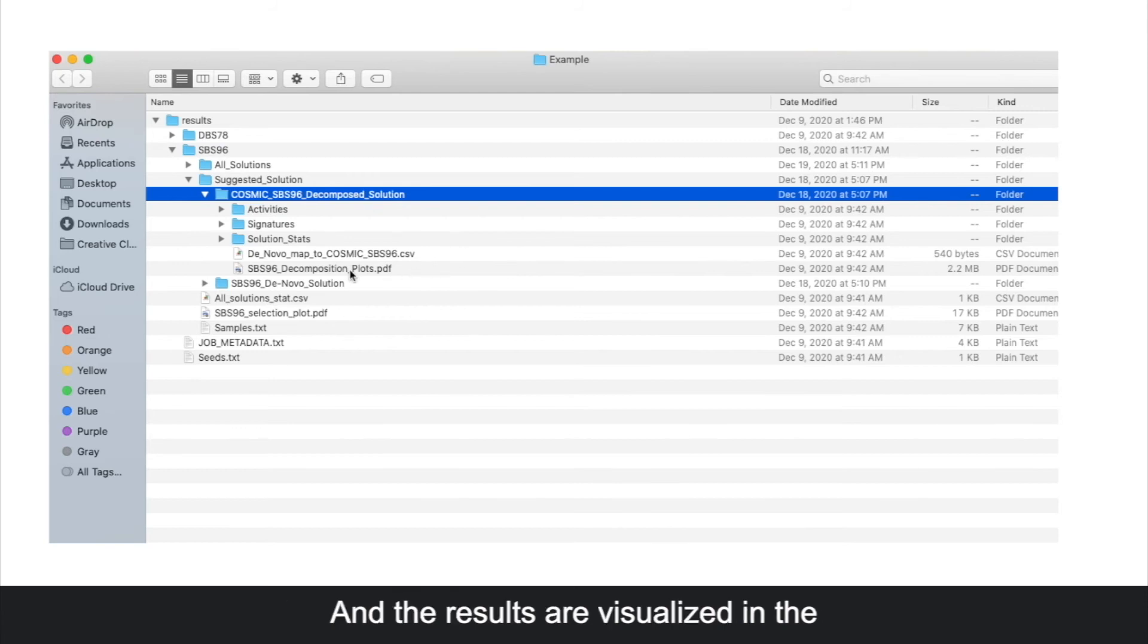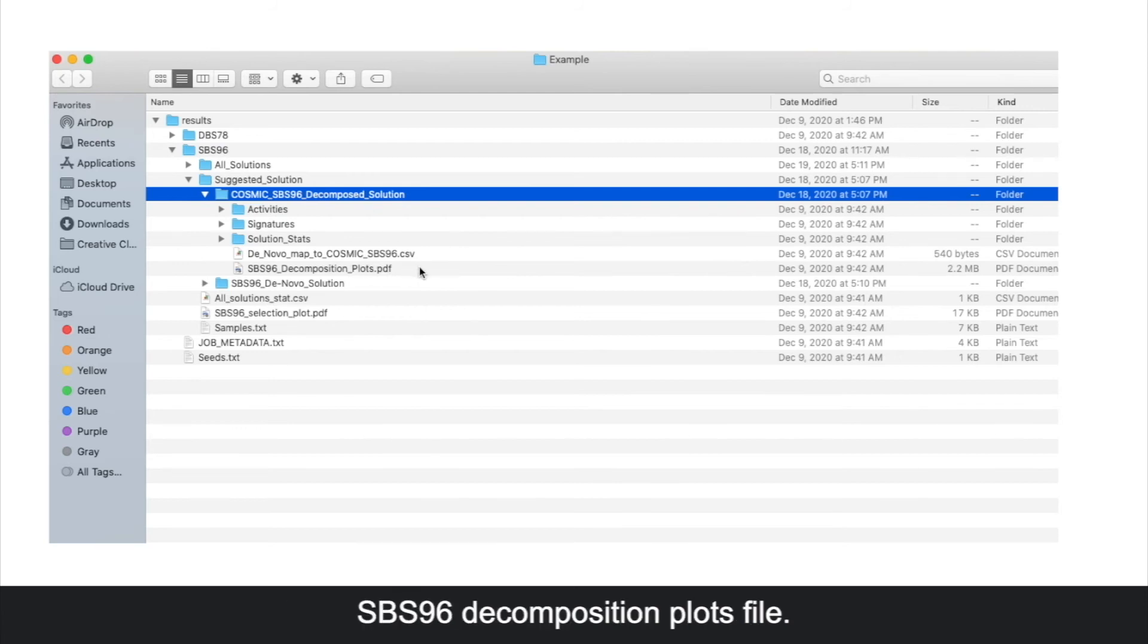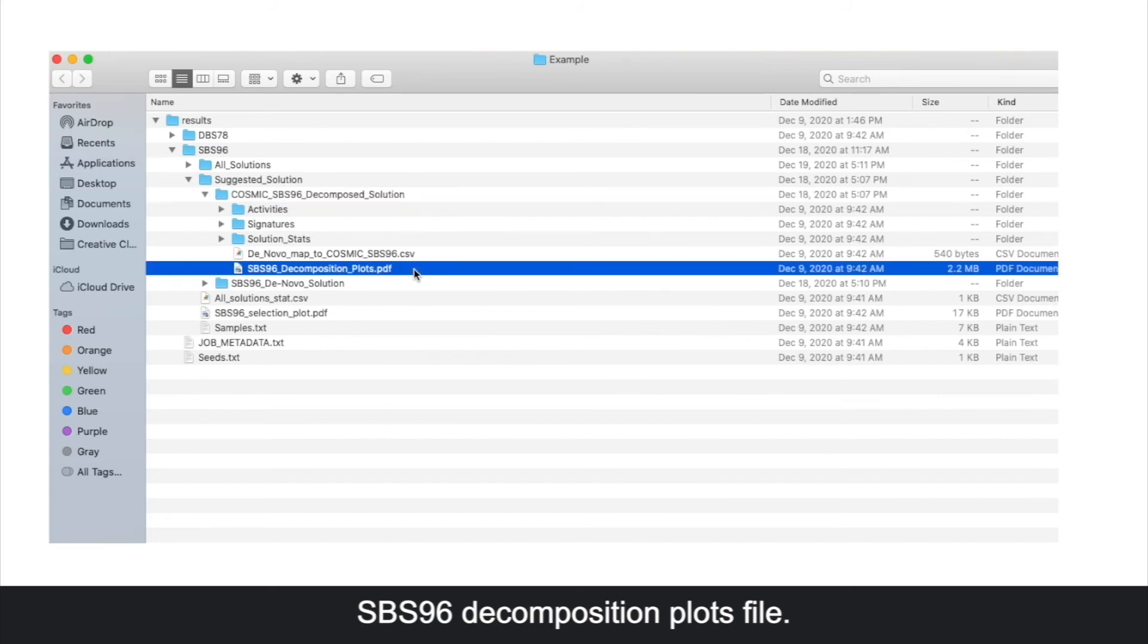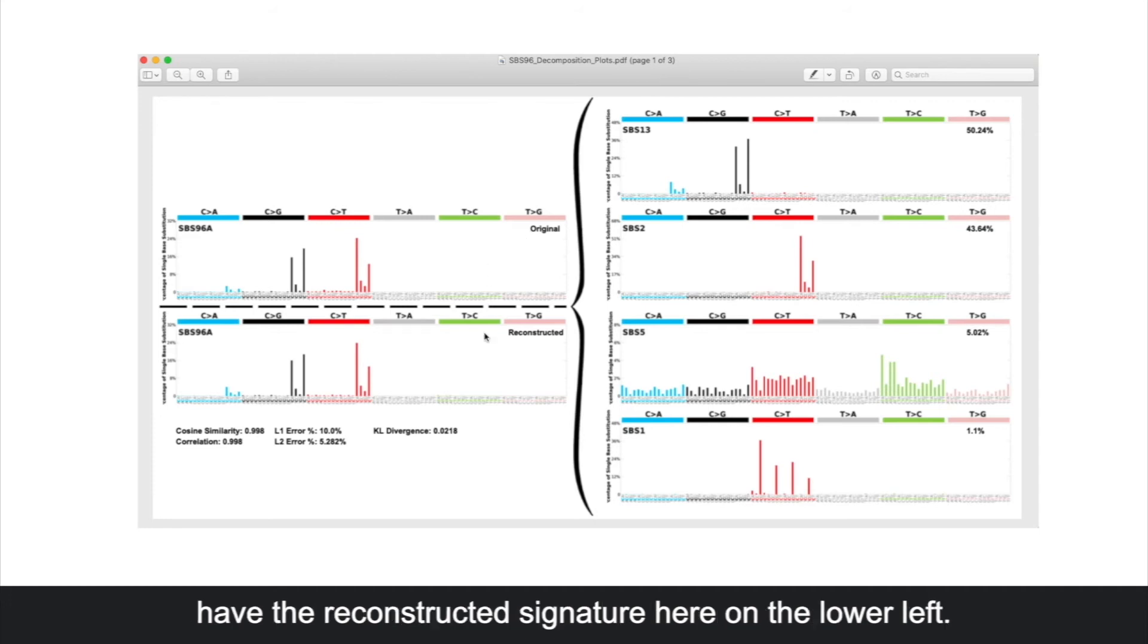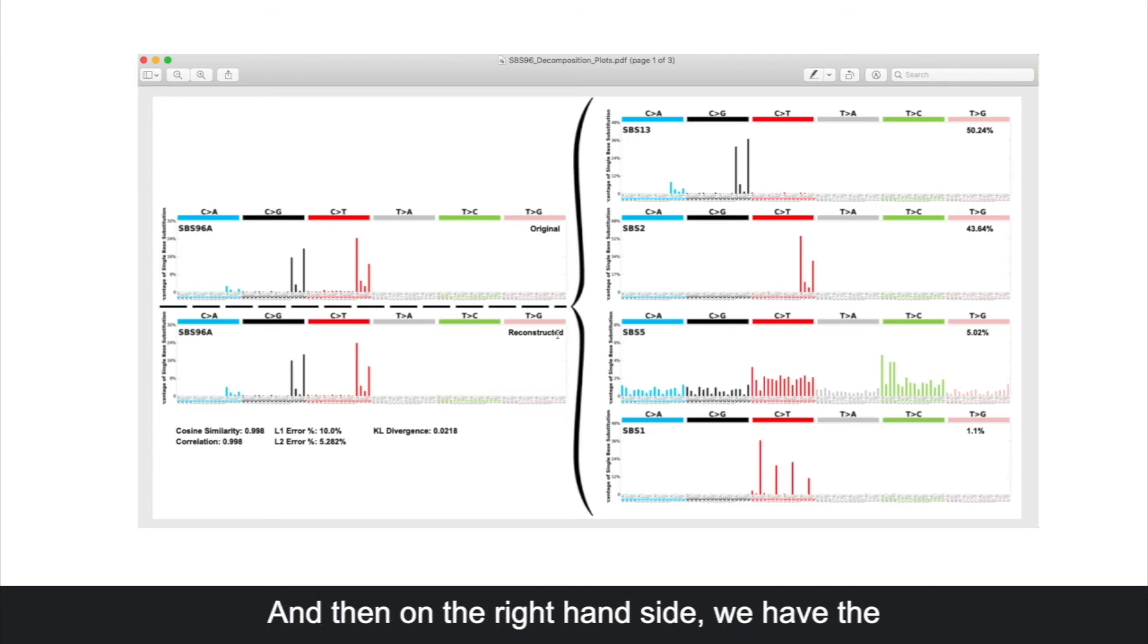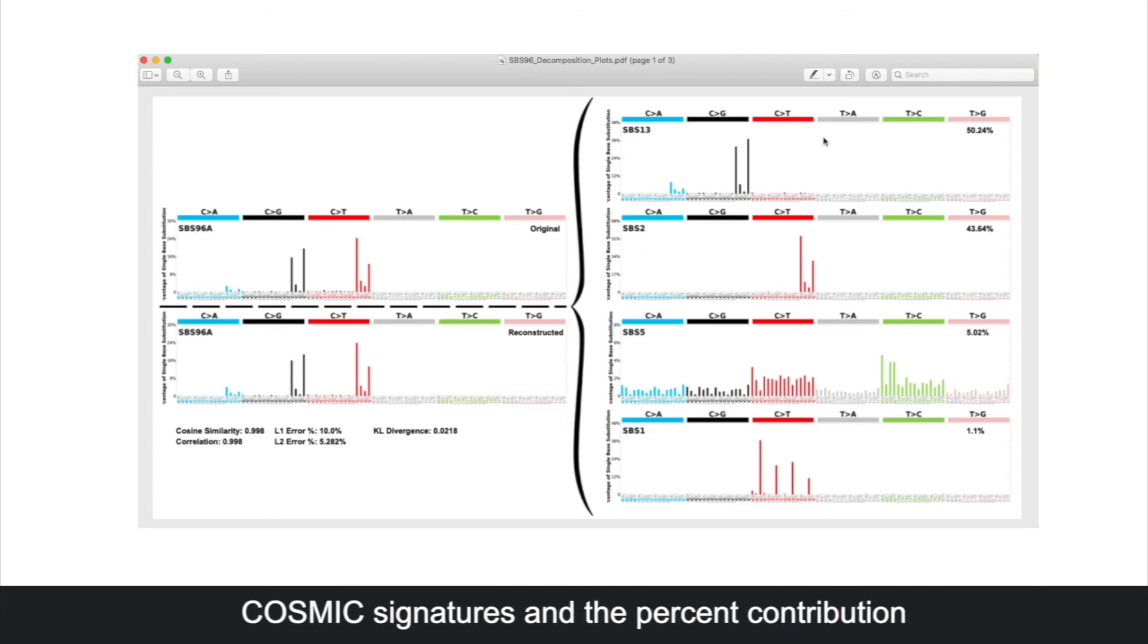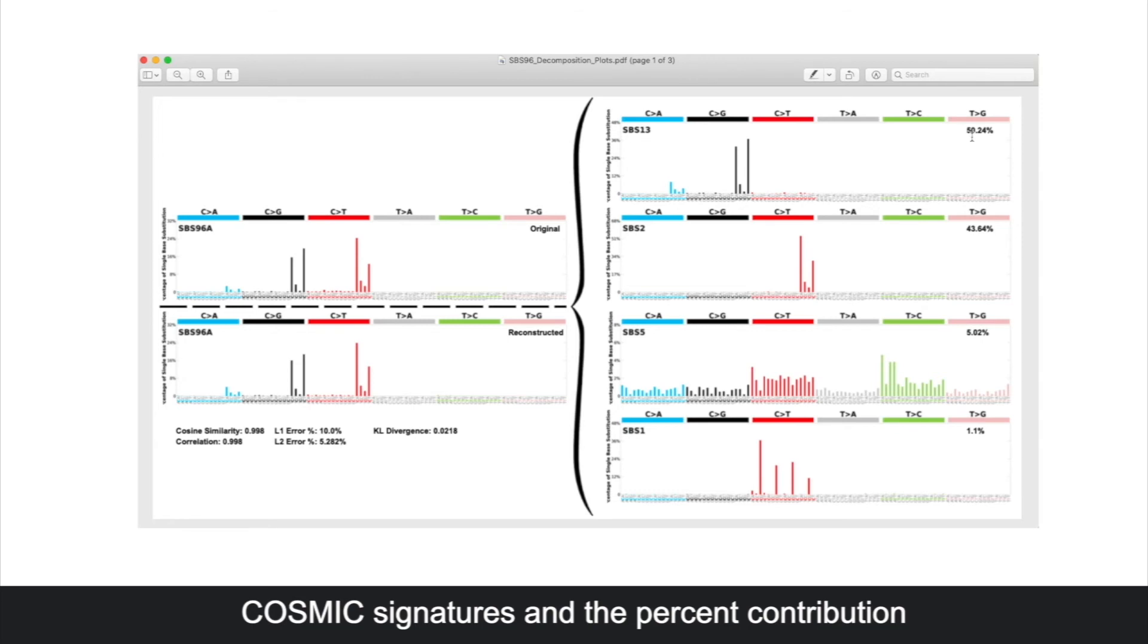The results are visualized in the sbs96 decomposition plots file. When we open up this file, we see that we have the original de novo signature on the upper left, and the reconstructed signature on the lower left. On the right hand side, we have the cosmic signatures and the percent contribution that each of them makes.